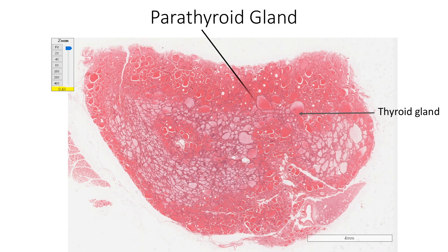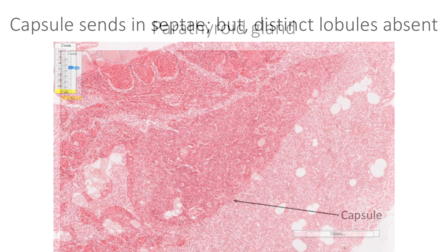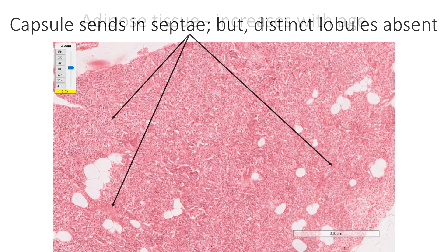In this section, we can see the section of parathyroid gland adjacent to thyroid gland. Parathyroid gland is covered by a delicate capsule. Although this capsule sends in septae, distinct well-defined lobules are not seen in the parathyroid gland parenchyma.